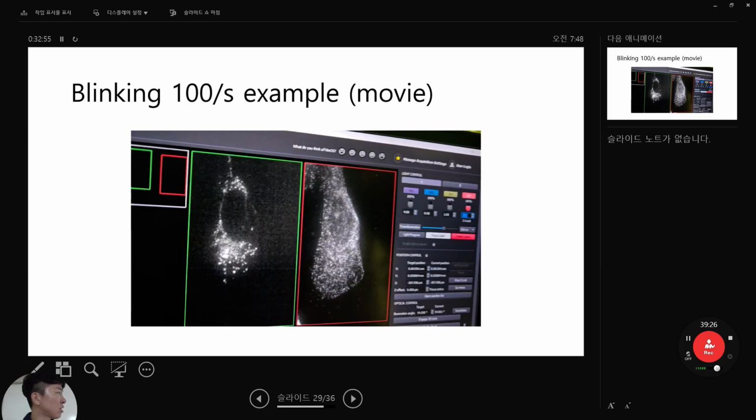But how can you get two images at the same time? If you want to do that, you take 10K images first for red, and then sequentially you can set up 10K for the green. Also, when you set green and then red, even though you are doing 10K, 10K, you can get maybe 13K, 13K, something like that when you combine them together. So this is how you can get more images.